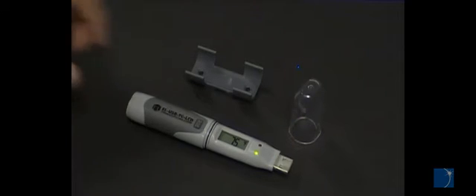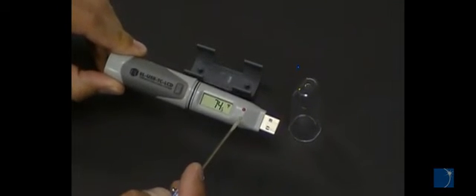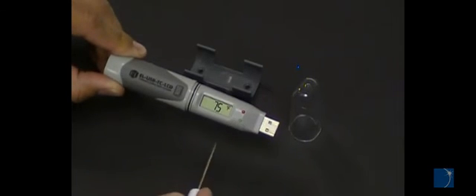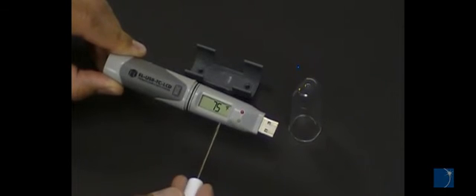EL-USB loggers use LEDs to indicate when data is being recorded or when an alarm level has been breached. Some EL-USB loggers include an LCD display, while others do not.